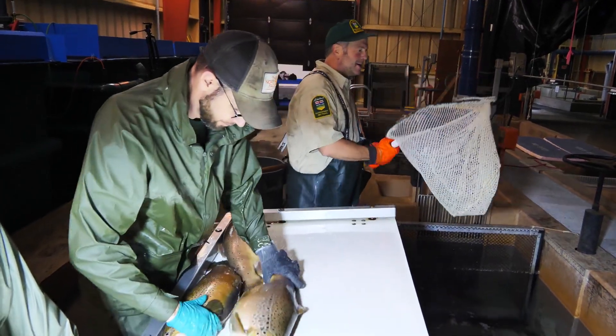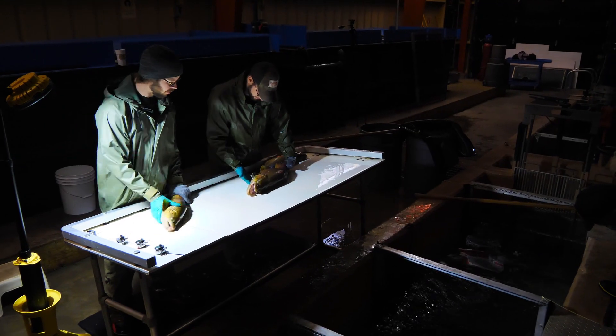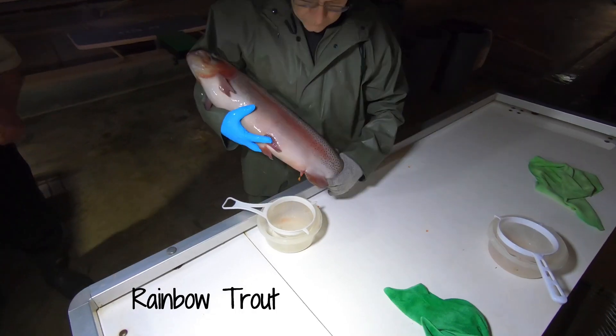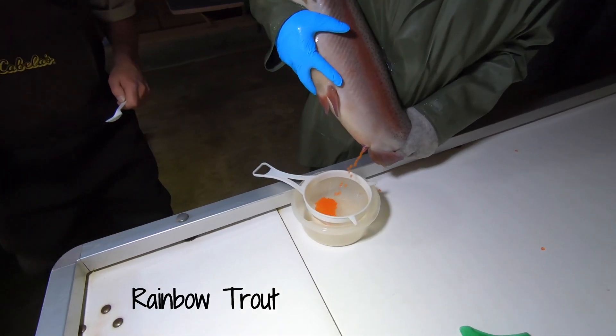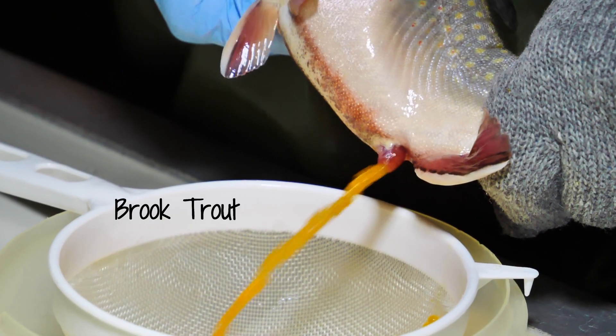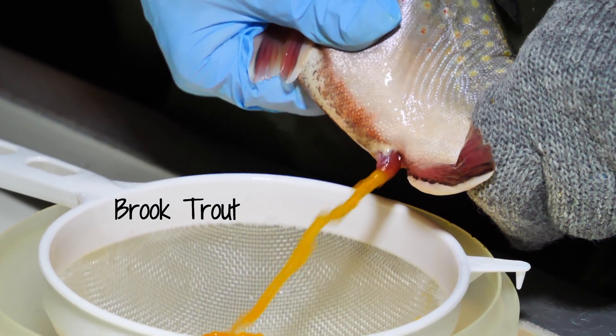As spawning season approaches, adults are observed for ripeness. Once ready to spawn, the ripe males and females are sorted. Females are expressed and eggs are collected in 1.5 liter containers and transferred to the triploidizing area in a cooler on ice.